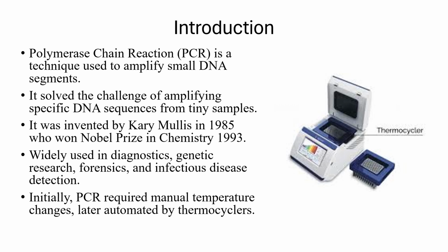So what is PCR? PCR is a technique that has been used to amplify DNA segments. Amplify is to increase the copies, which is the essence of amplifying. A good example is HIV. If someone was infected with the virus, the predominant techniques depended on seeing the antibodies produced by the body after the virus has been there for a long period of time.